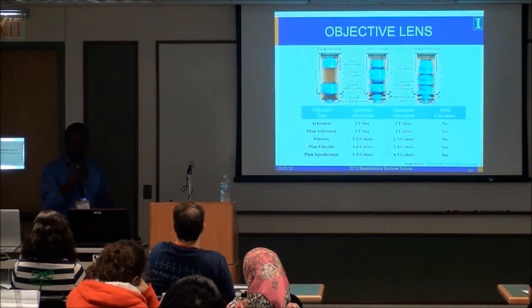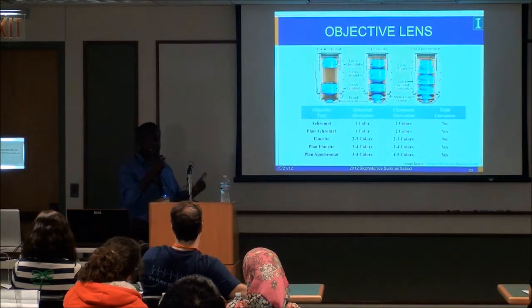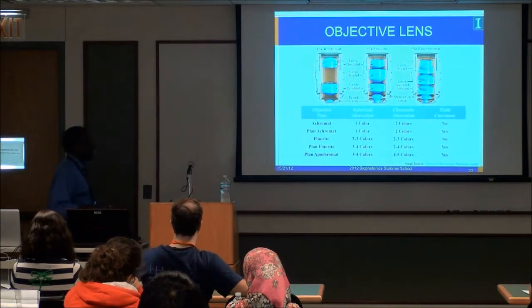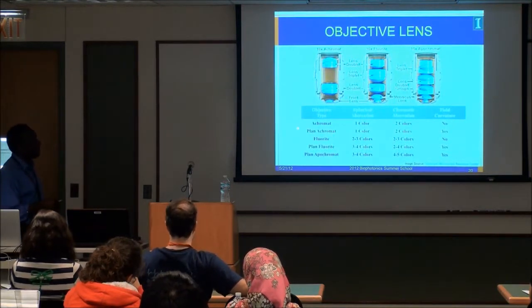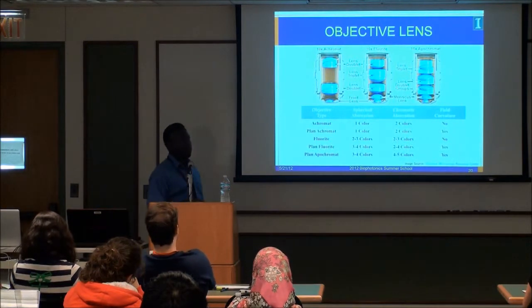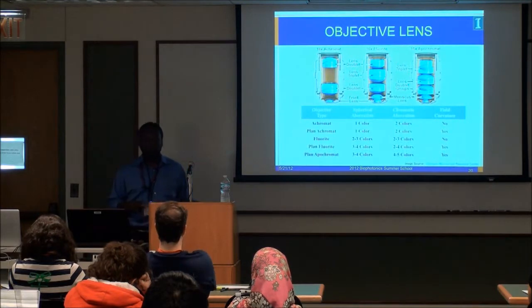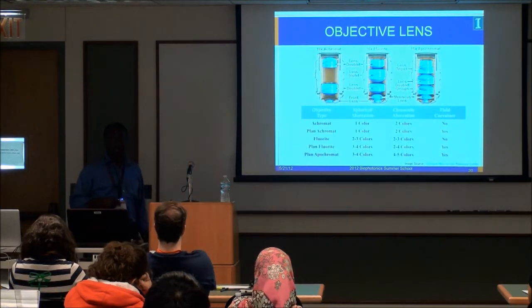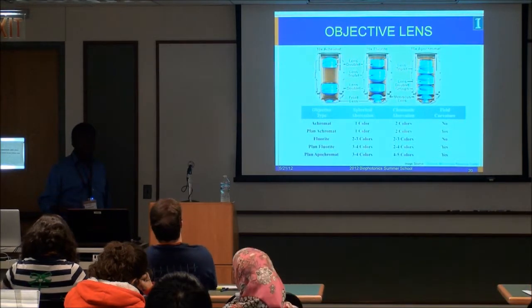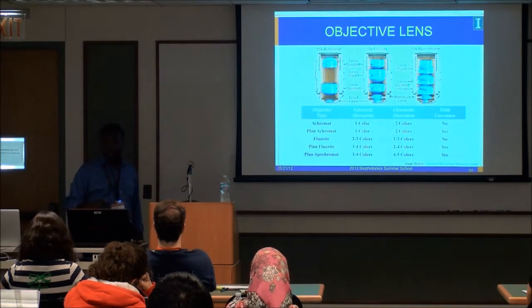So you can imagine now if you have a student scratching it and putting their fingerprints and all that and cleaning it with Windex, you know, so that becomes a problem. Okay, that's 10x. Anyway, so then you have sort of the cheaper lenses. These things can go down. I think Thorlabs, you can wind up paying $300, $400, $500 for a cheap objective lens. Okay, and you can do some really cool optics with it. A lot of optical trapping work, just some basic imaging, you can get away with using something that's not highly corrected, if you know what you're doing.